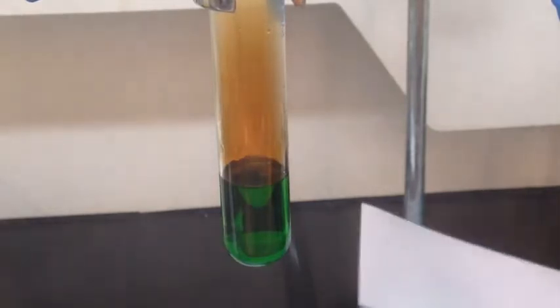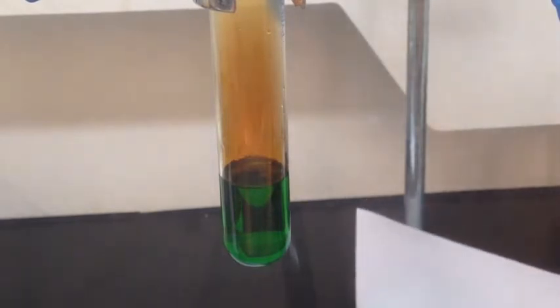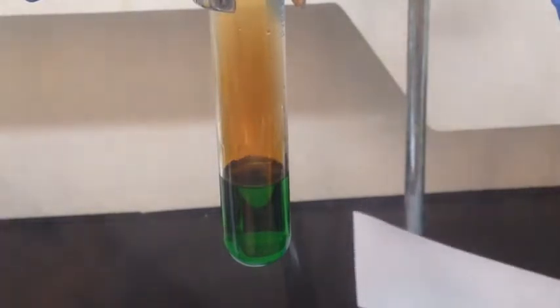And you'll notice there's some brown gas that appeared right above the surface. That one is nitrogen dioxide. Nitrogen dioxide is extremely toxic and highly water soluble. So we know nitrogen dioxide is one of the pollutant gases in the air.